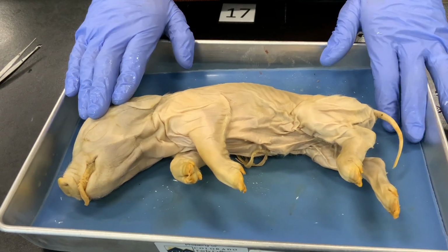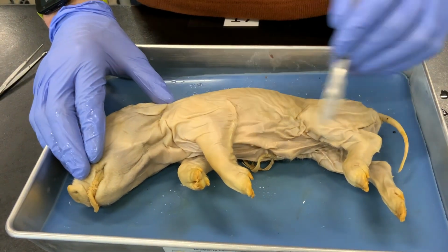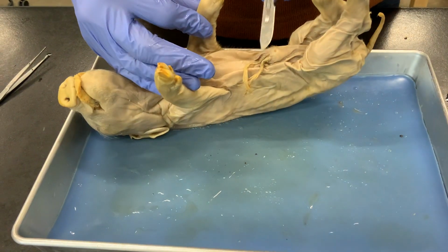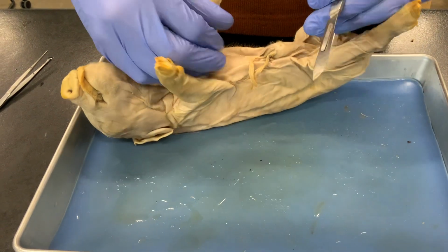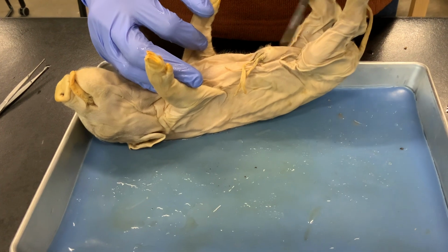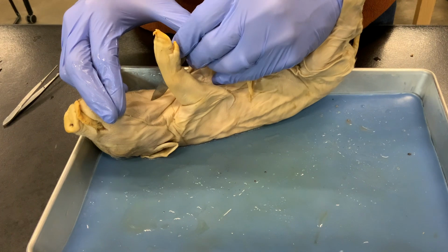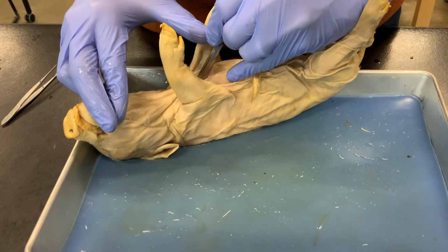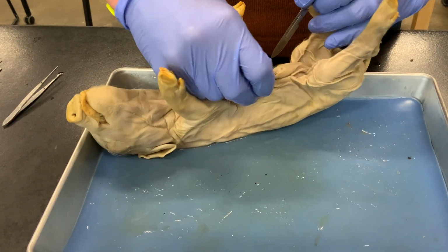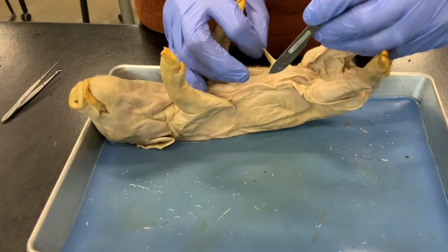We're going to open it the same way we did the frog, with a single longitudinal section along the ventral side, except that because of the urogenital opening and the umbilical cord being in the way, we can't make a single cut the full length of the abdomen. We'll have to make a Y here on either side of that structure. So if we start at the front of the abdomen, make a cut through the body wall back to here, we'll have to make 2 cuts from here back on either side.